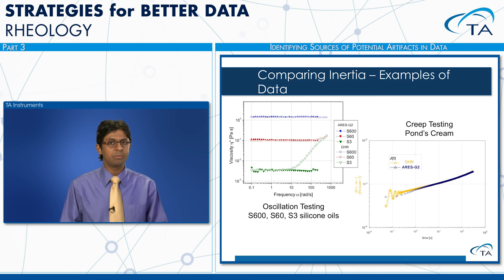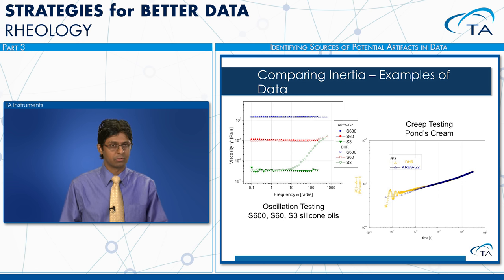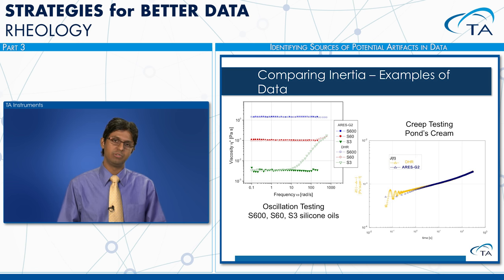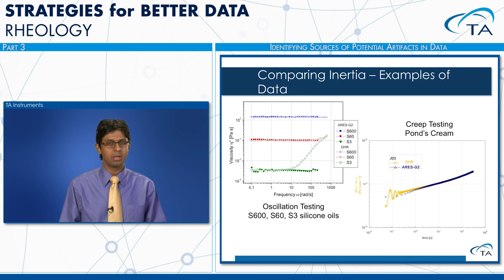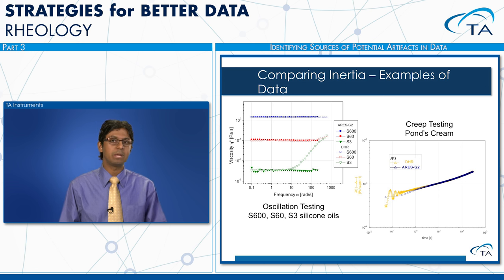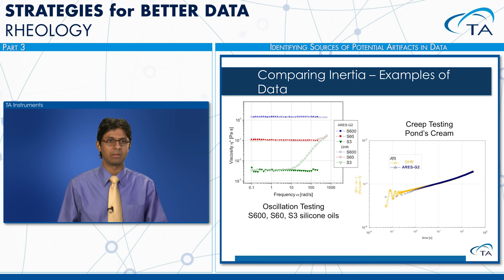Inertial effects can also appear in creep experiments with low stiffness samples. Shown here are creep tests on both the ARES G2 and the DHR on PONS cream. With the DHR system, we see inertial creep ringing; these effects are not present with the ARES G2. Note that some rheological information can be obtained by fitting certain models to the creep ringing data, which might be useful depending on what you're doing.